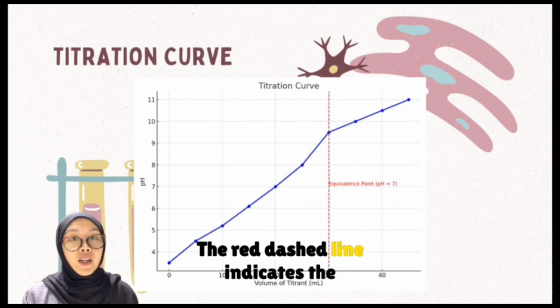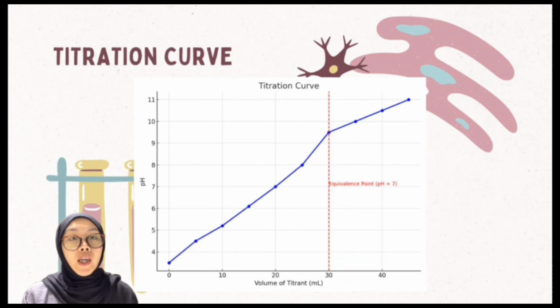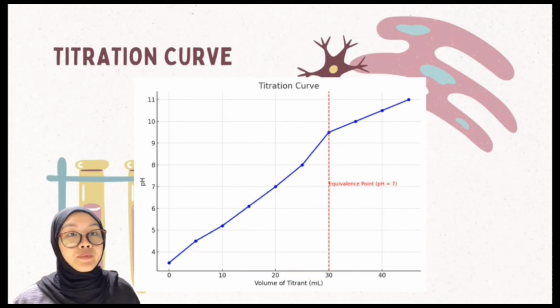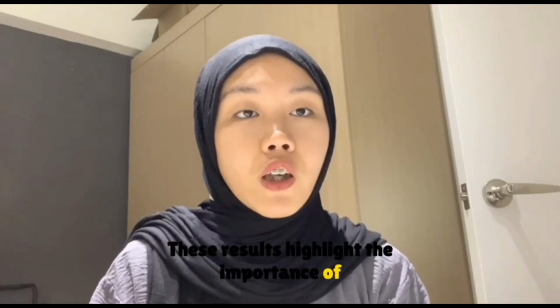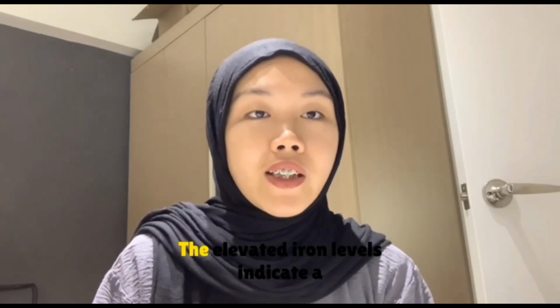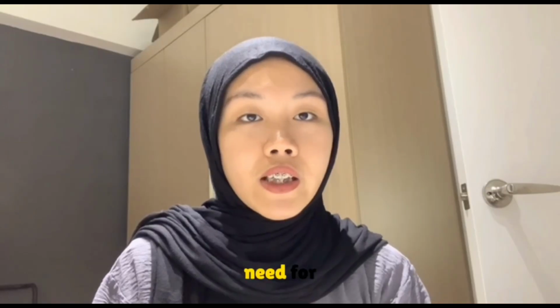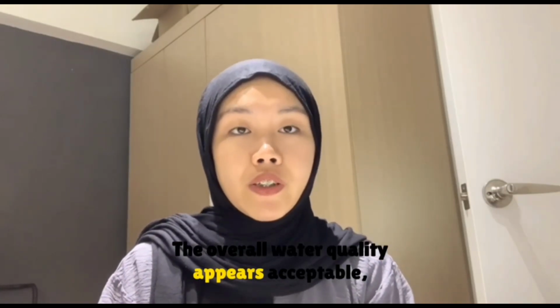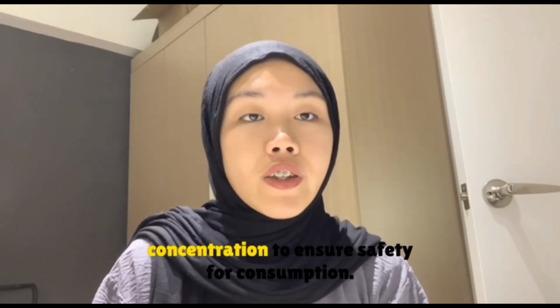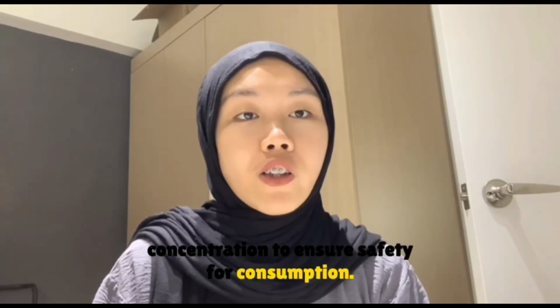The red dashed line indicates the equivalence point, and the label marks the pH value at this critical point in the titration process. These results highlight the importance of regular water testing to ensure water quality. While some contaminants are within safe limits, the elevated iron levels indicate a need for further treatment or filtration. The overall water quality appears acceptable, but attention should be given to areas with higher iron concentration to ensure safety for consumption.